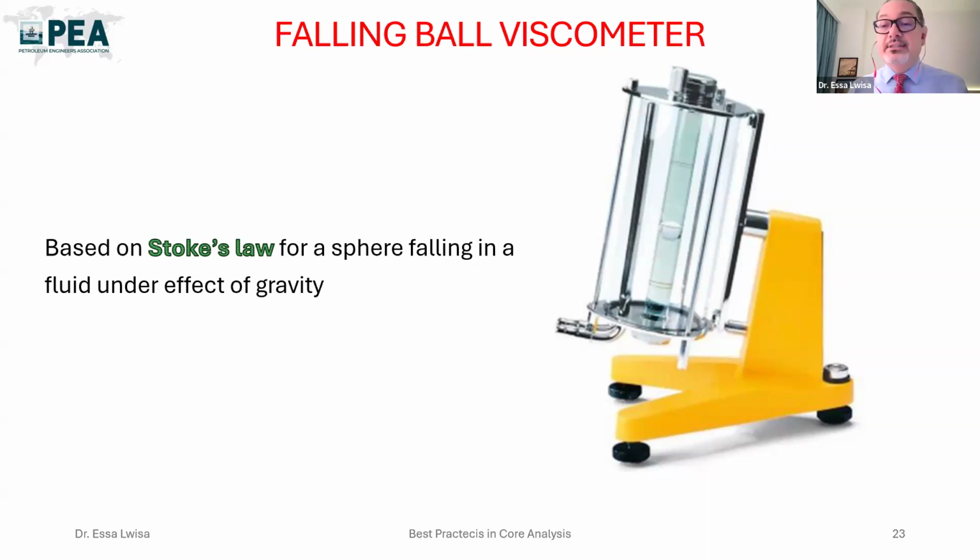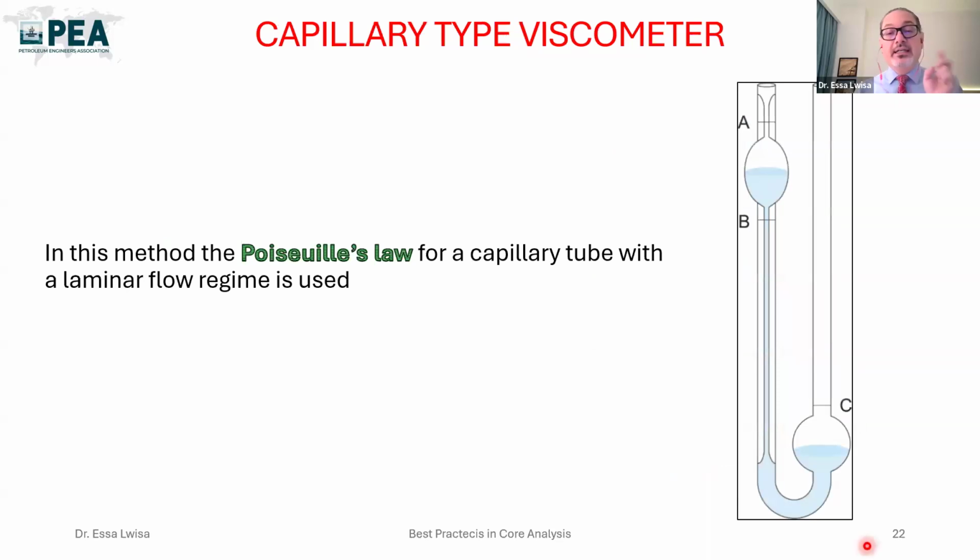The polished steel ball is dropped into a glass tube of a somewhat larger diameter containing the liquid, and the time required for the ball to fall at constant velocity through a specific distance between reference marks is recorded. The rolling ball viscometer will give good results as long as the fluid flow in the tube remains in the laminar range. In some instruments of this type, both pressure and temperature may be controlled. Of course, even with this one you can elevate only temperature, not pressure. You can place it in a water bath.